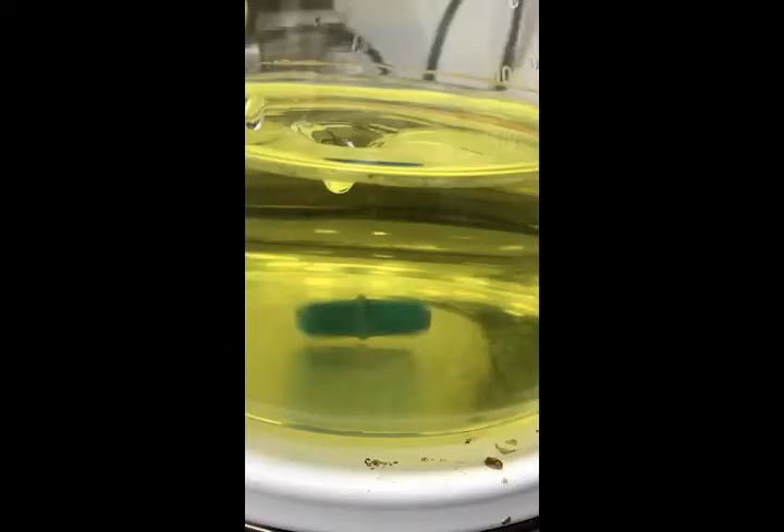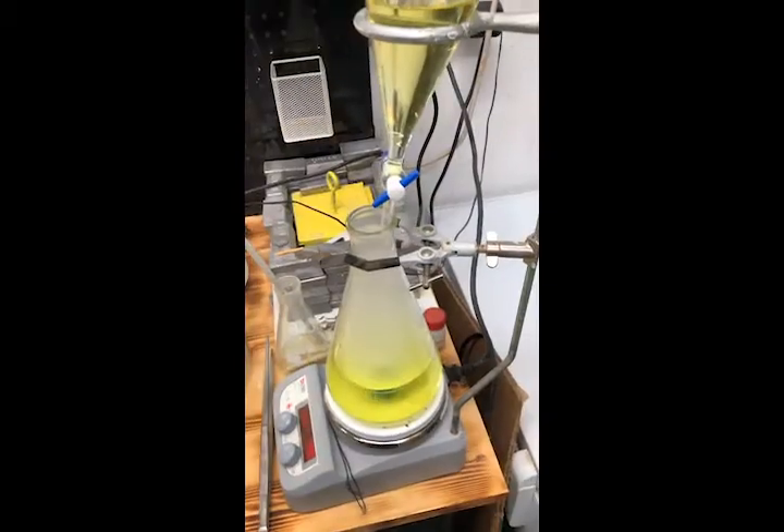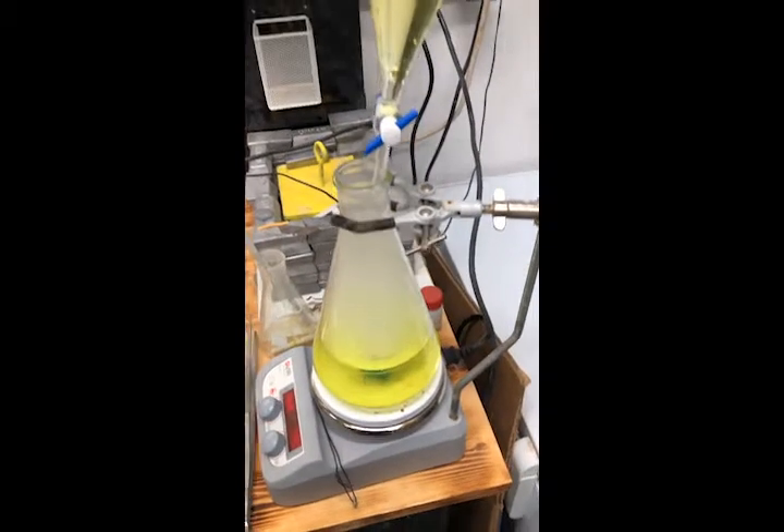Today we're going to look at the process of getting uranyl carbonate from solution to solid ammonium diuranate. The first step is to neutralize the carbonate.